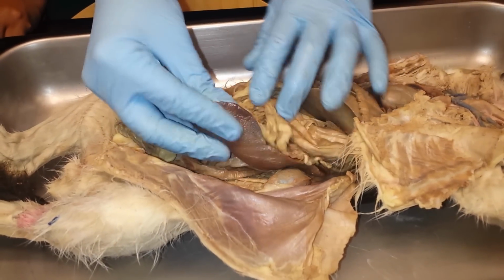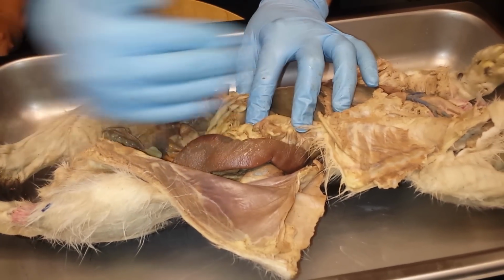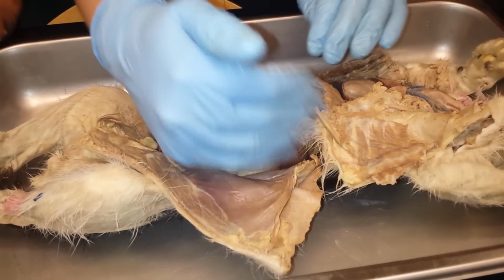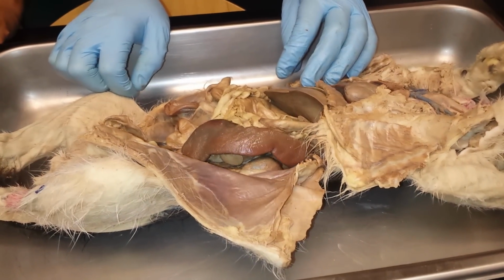And then the last one to point out is this organ right here located on the left-hand side that kind of runs parallel along with the spine, I guess, but more on the left-hand side. It's up and down. This is the spleen. Okay? This is the spleen. All right, and that's it.